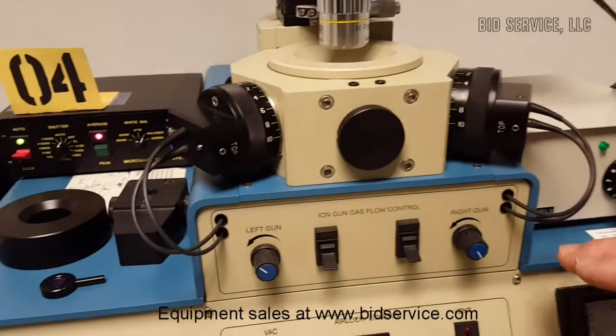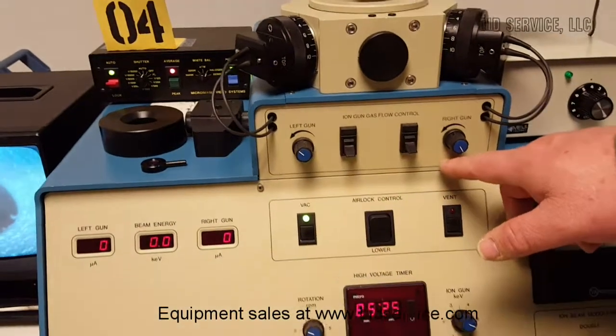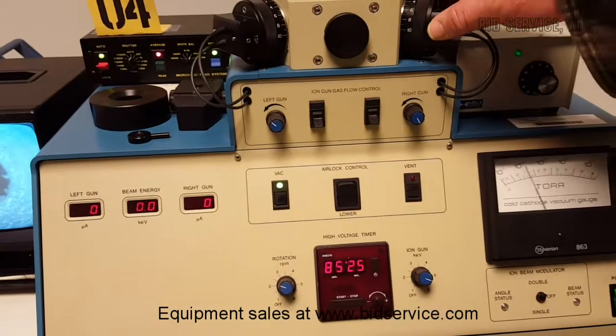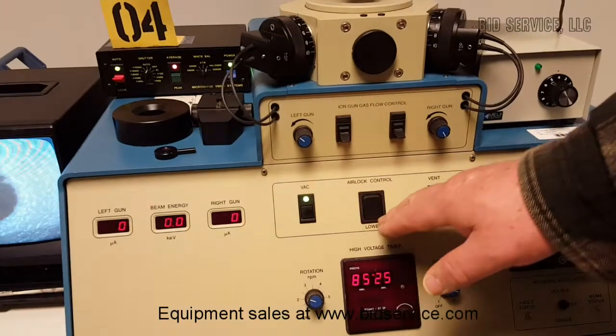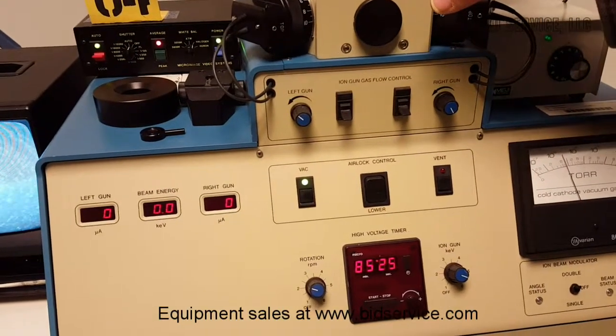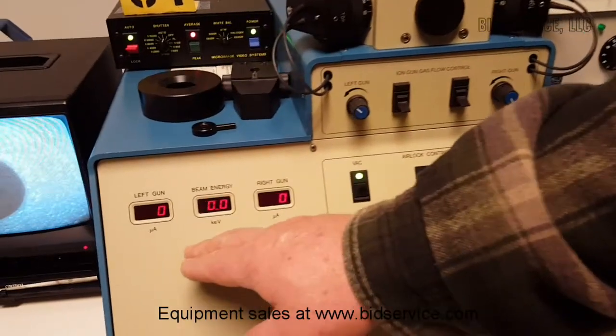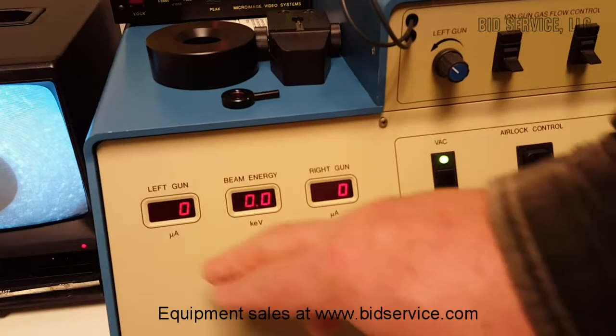Then we have the system itself. Up here is all your gas controls. You've got two ion polishers — left and right — then you have your airlock control that can open and close the lid right here, so you can install your specimens. Over here you've got your beam energy and your controls that tell you how many amperage on your left gun and right gun.